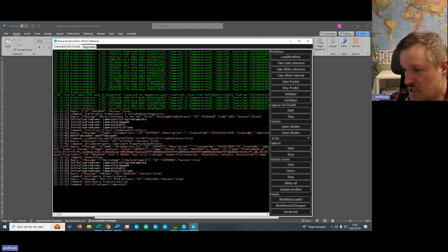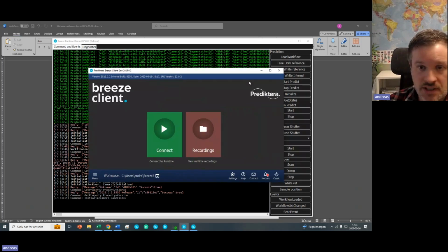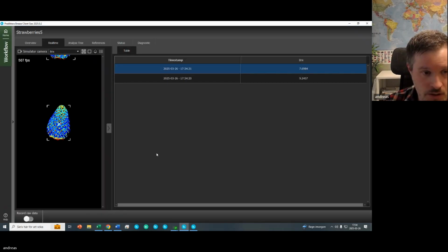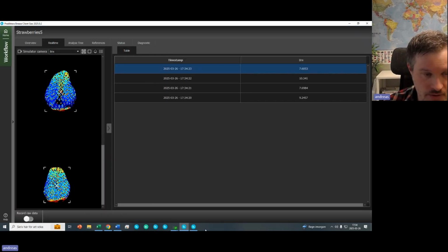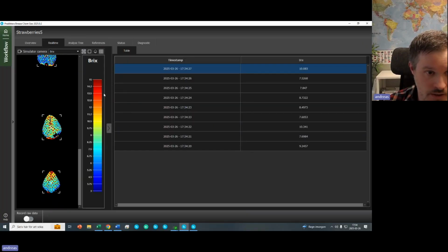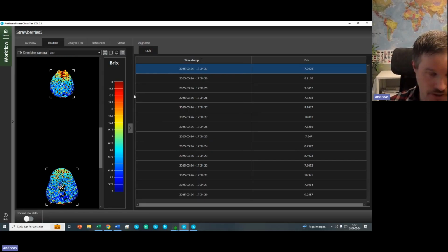And of course, now we want to visualize that. So I will go to the Breeze client program here, and I will press the connect button. And here we go. Now we have the results coming out. So for each strawberry, we are reading the data continuously.